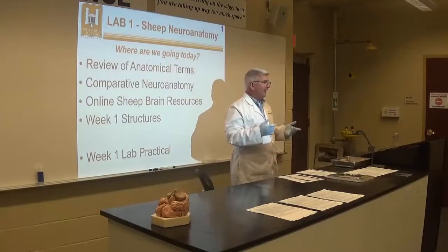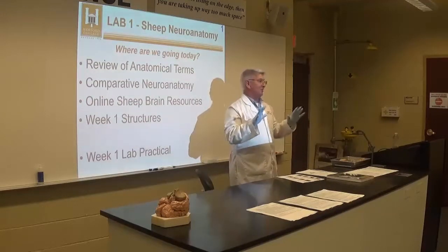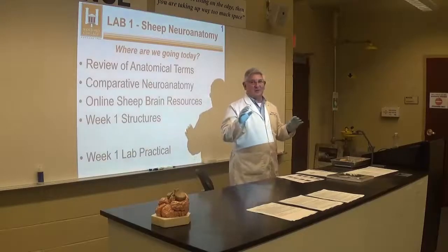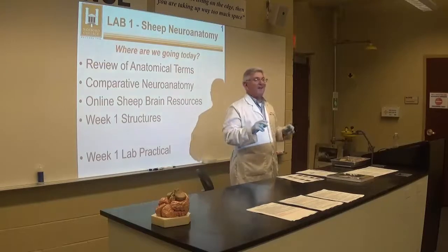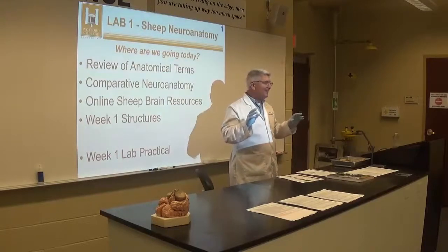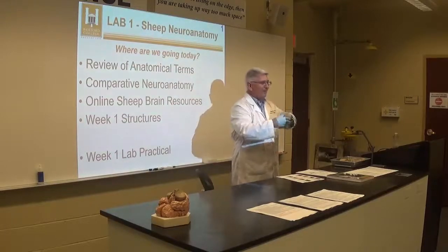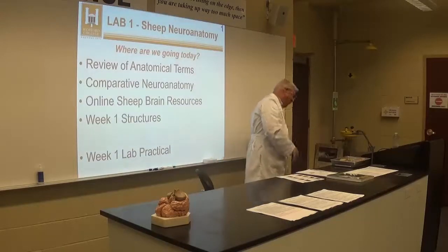When we're handling the brains, we wear gloves — very important. The preserving agent the brains are packed in is called caro-safe, meaning it's safe. But I wouldn't drink it, lick it, or put it on my face. So when you're done handling the brains and going to do something else, take off your gloves and throw them away.